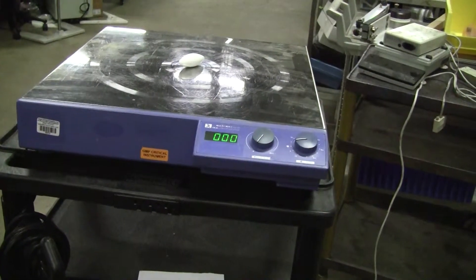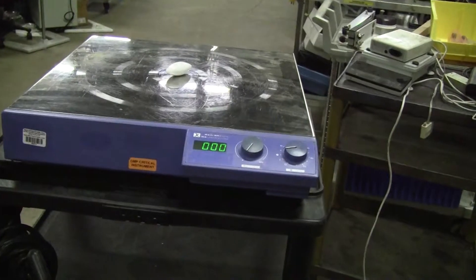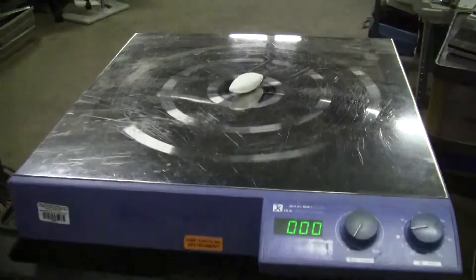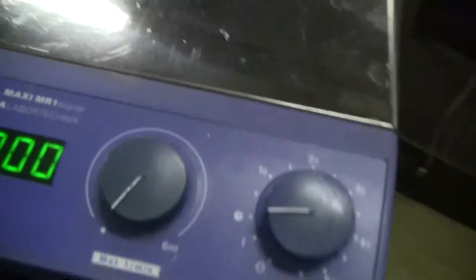Hi, this is Jim from HitechTrader. We're looking at an IKA Maxi MR 1 Magnetic Stirrer. It's a big one. It's got a top of 19.5x19.5, stainless steel, digital readout.